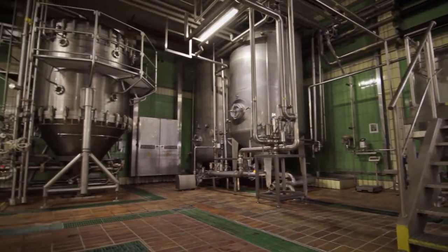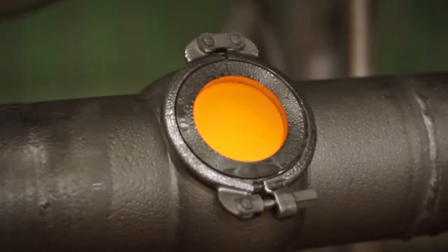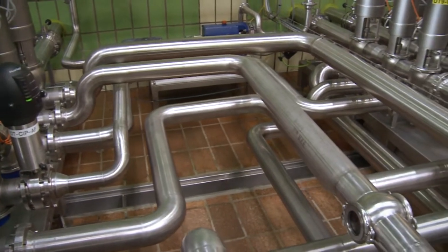Whether in the filtration, at the bright beer tank, out of filling lines or tankers, this measurement process is the same for all sample points.